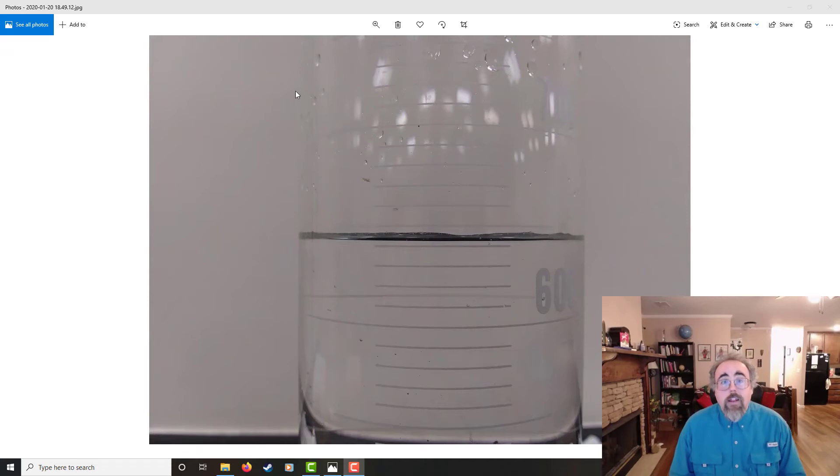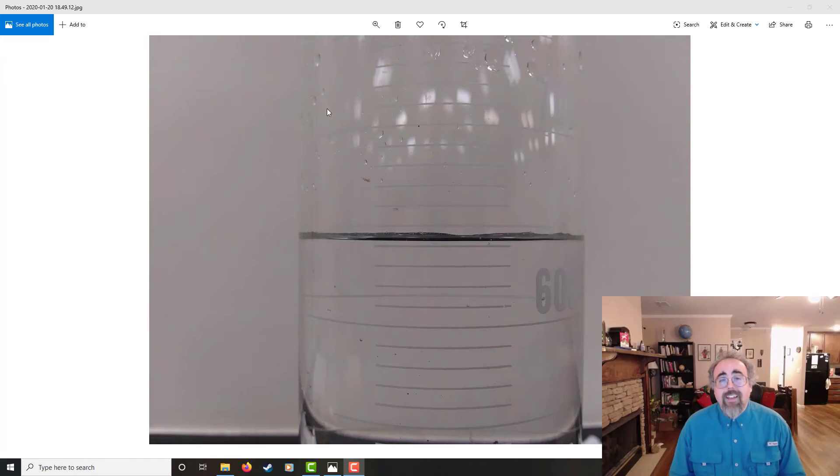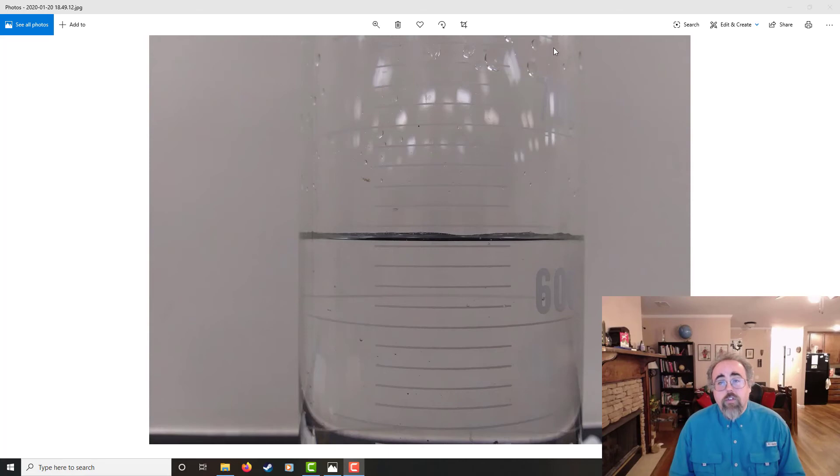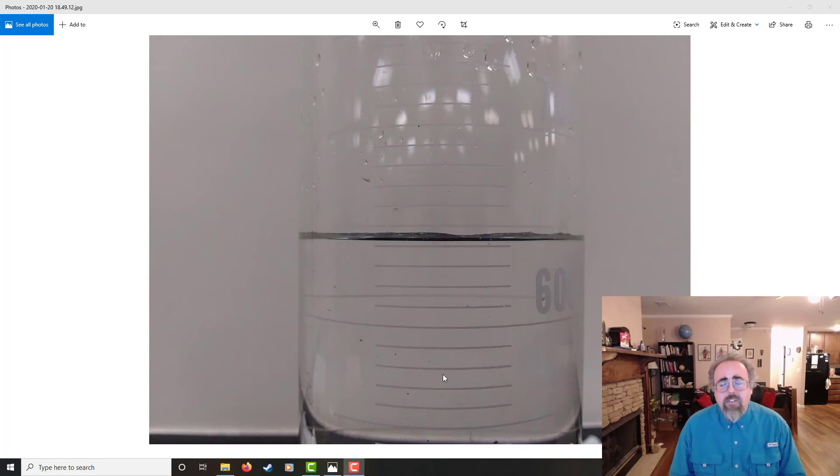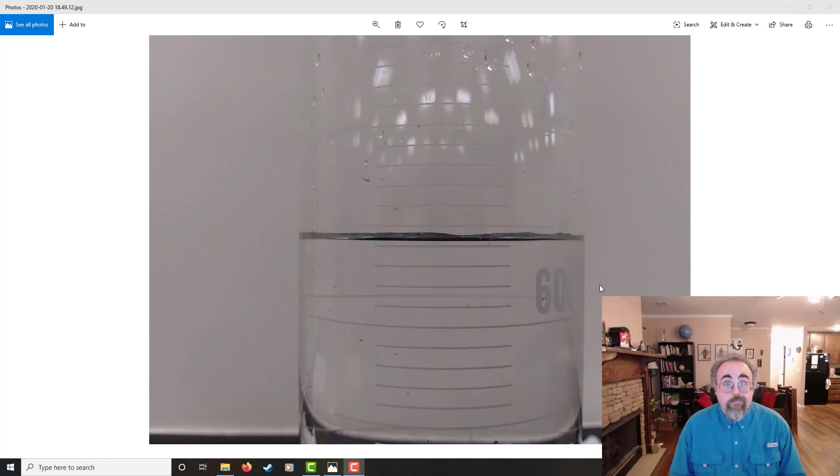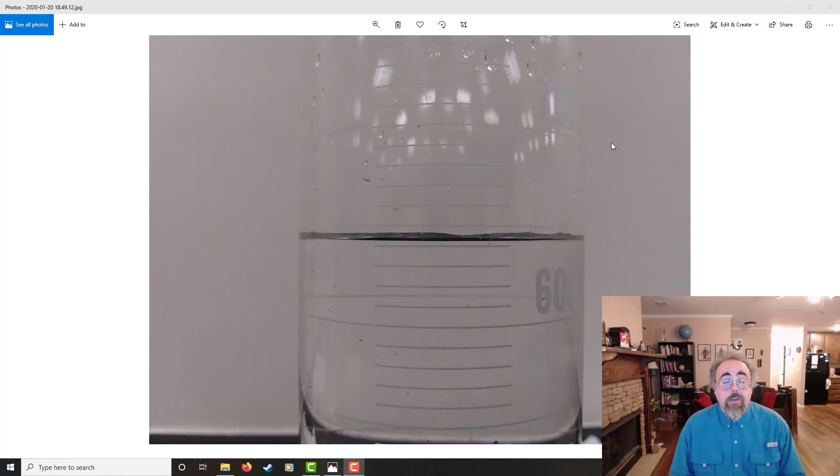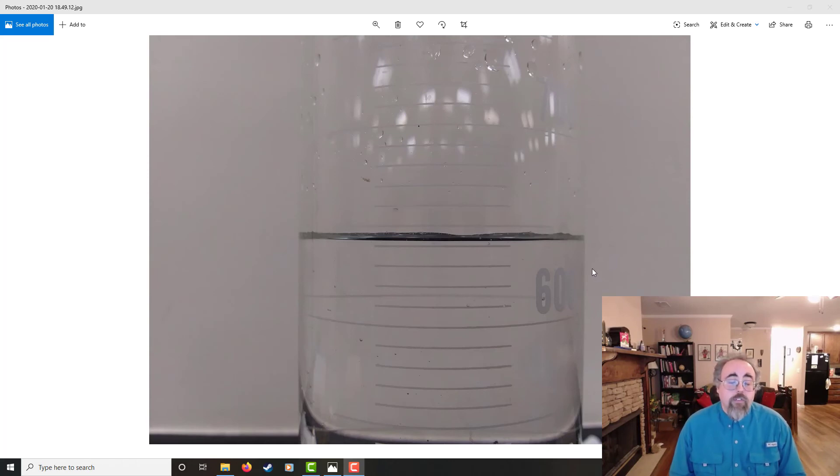Now, a couple other things to look at. Notice how I've got some spots on this one. This is just one I pulled off the shelf. Water drops, what's clinging to your stuff, that's generally a telltale sign it needs a bath. That's usually dirt particles that are stuck there. The water's hanging onto that. And that will affect as well as bubbles. So I think there's a couple of bubbles in there. Obviously, little bubbles aren't going to affect you much, but they are taking up space, and they're not your liquid. So with this guy, he probably needs a bathroom, to be told. He was just kind of sitting on the shelf for quite a while, and you know how it happens if stuff just sits there. Dust happens.